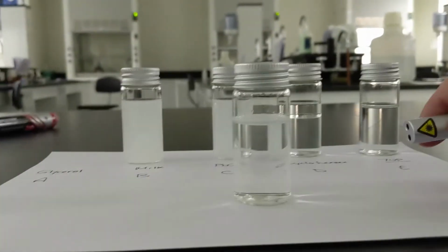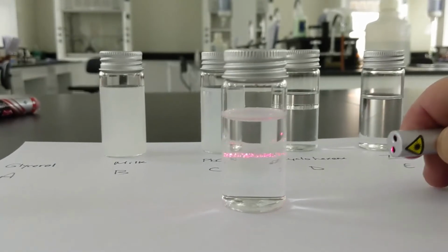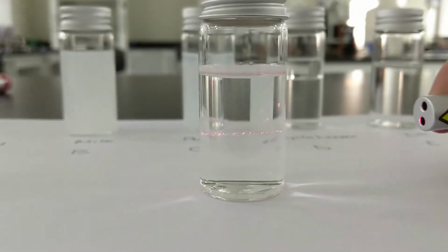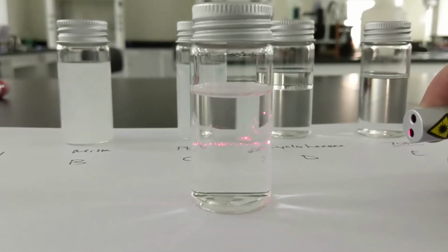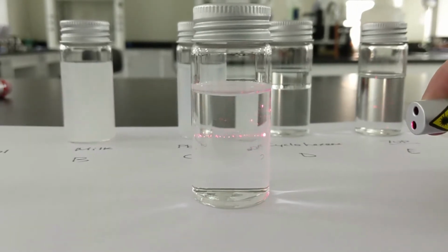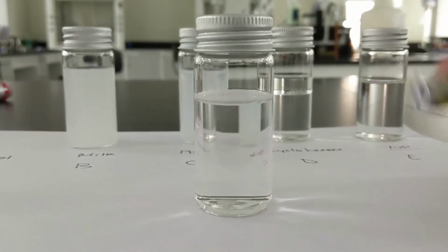So let's look at the glycerol. See what happens here. All right, look at that. So with the glycerol, I can see the laser. You can almost perfectly see which suspended particles it's actually collecting on. I'm noticing that this is collecting on these droplets. What I've done is shaken this up, so the glycerol molecules are suspended. Pretty cool.